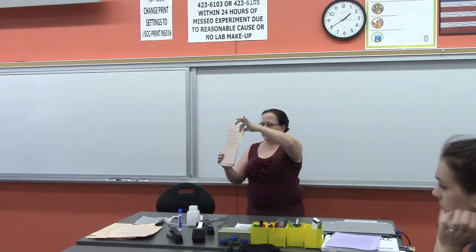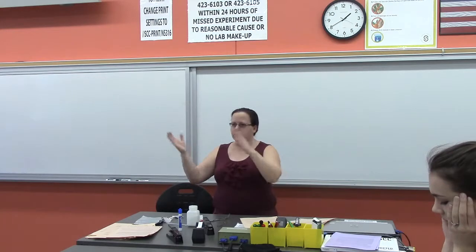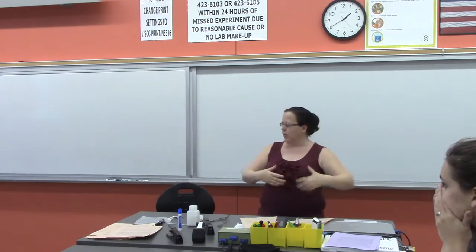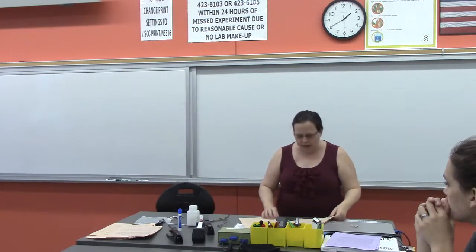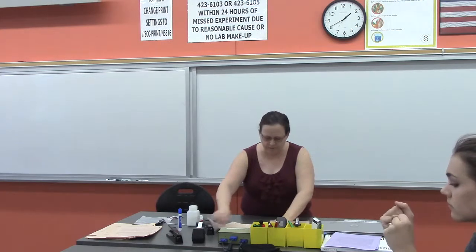Chemical changes lab today. The lab is in several parts, and each part has its own directions, data table, and questions. So make sure you complete everything within each part as you go along. We're going to start with part A, go through what you need to do, and then I'll let you work on your own from there.